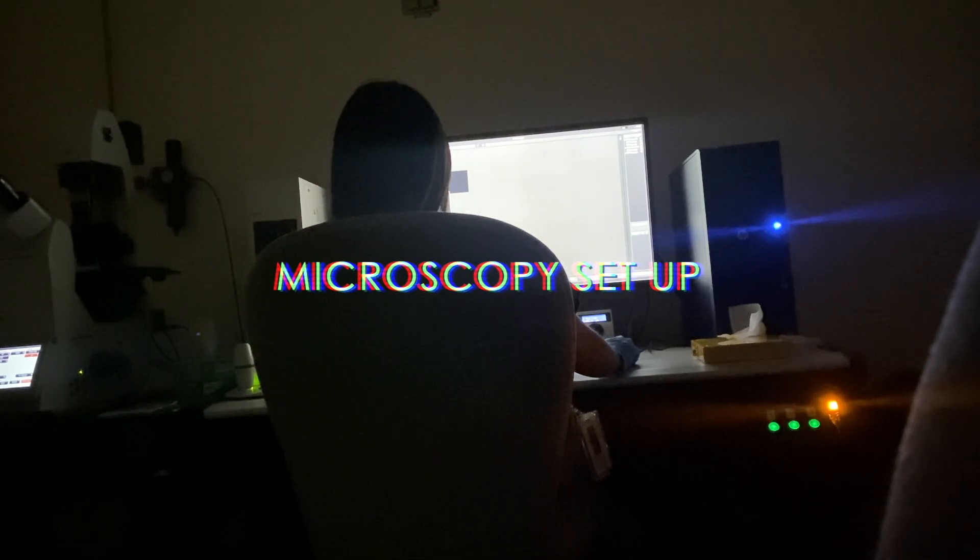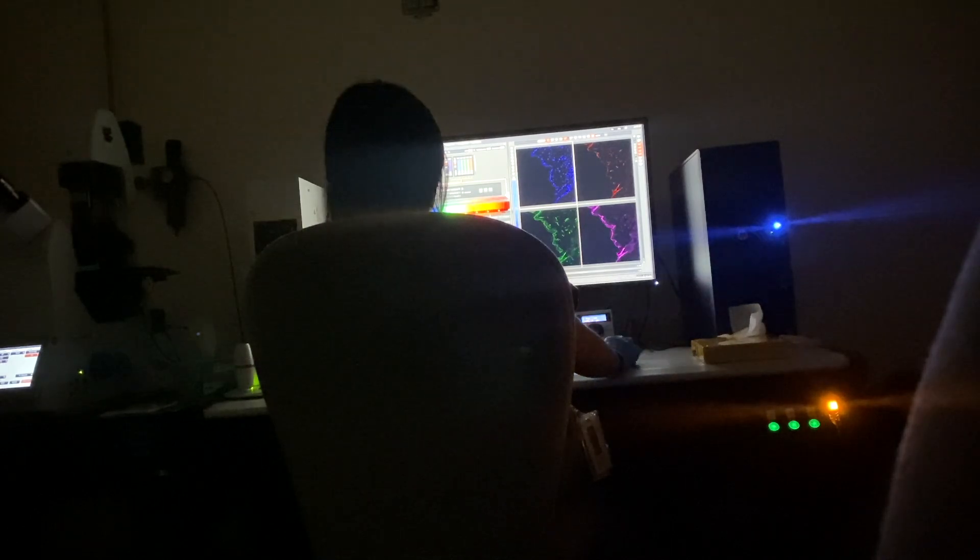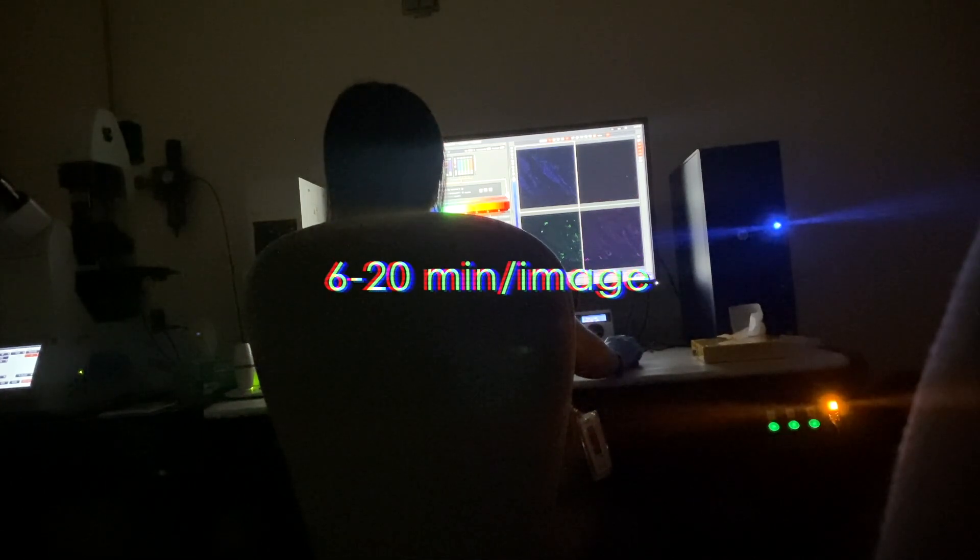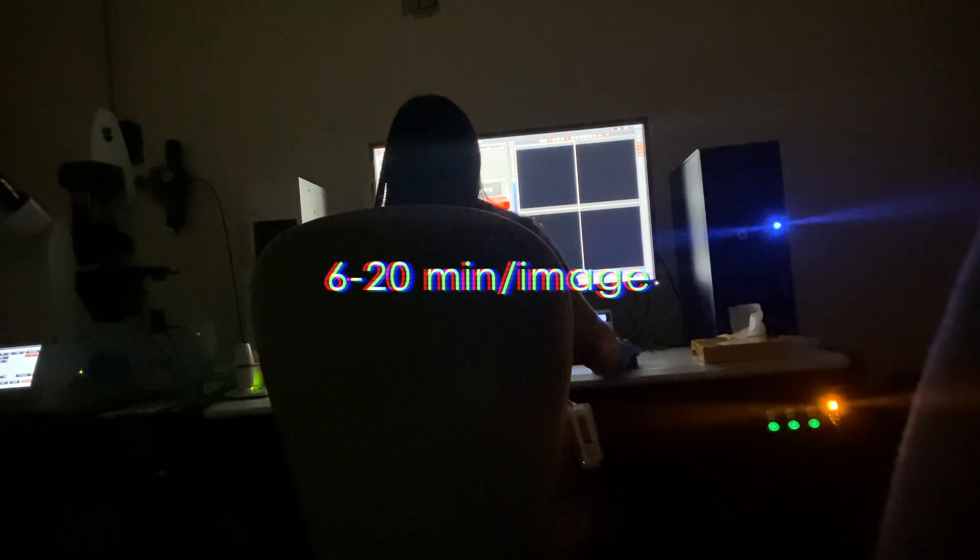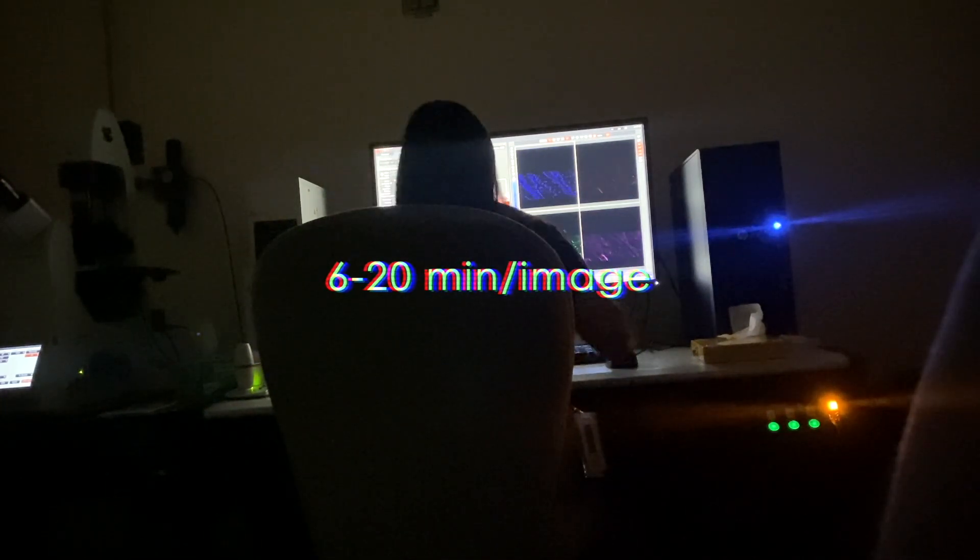For the microscopy setup, I have a glass slide with the tissue specimen set up on the left where the microscope is, and I'm viewing it through the camera that is showing a preview on the computer program on the right. I can adjust settings to make it look how I want and where I want it. But it takes me 6 to 20 minutes to take one big image after setting up, depending on how big of an area and how many layers of depth I'm imaging.